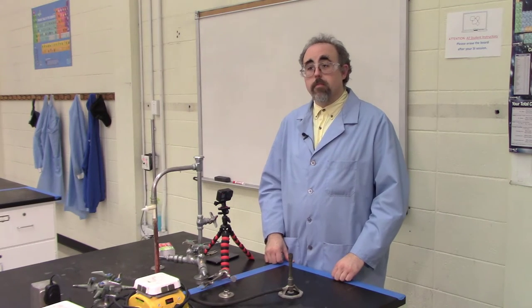Good day, I'm Dr. T, and welcome to my lab. Today I'd like to talk about the wonderful and incredible Bunsen burner, a very useful tool that we as chemists use quite often.